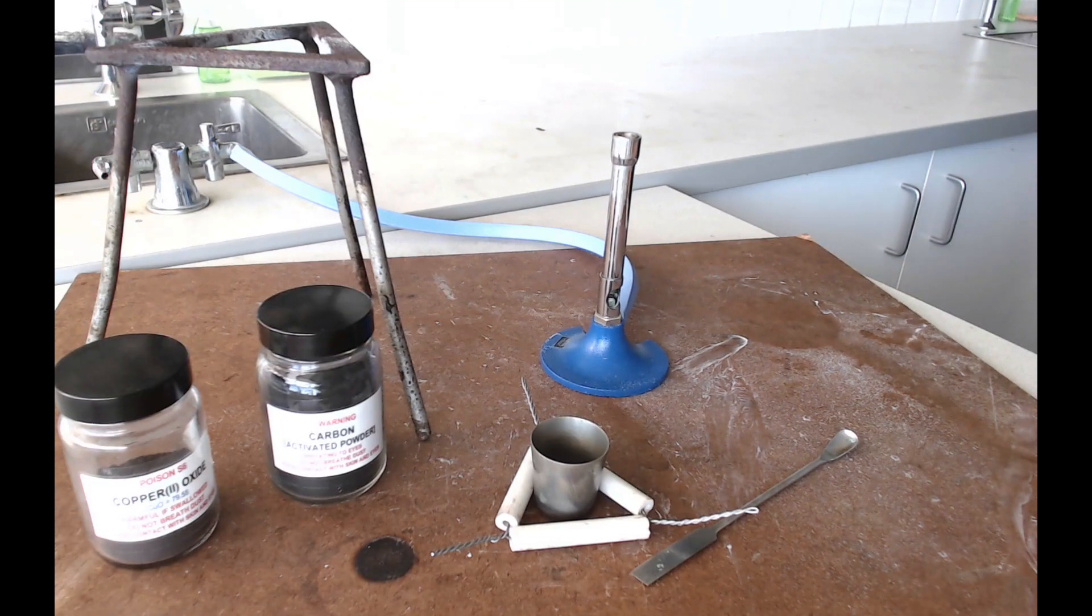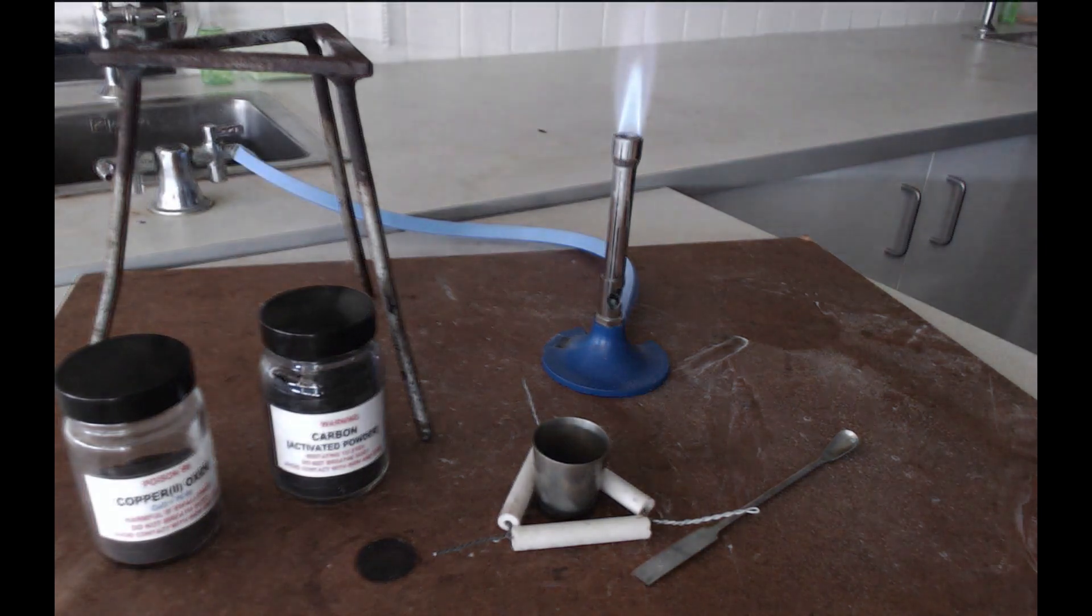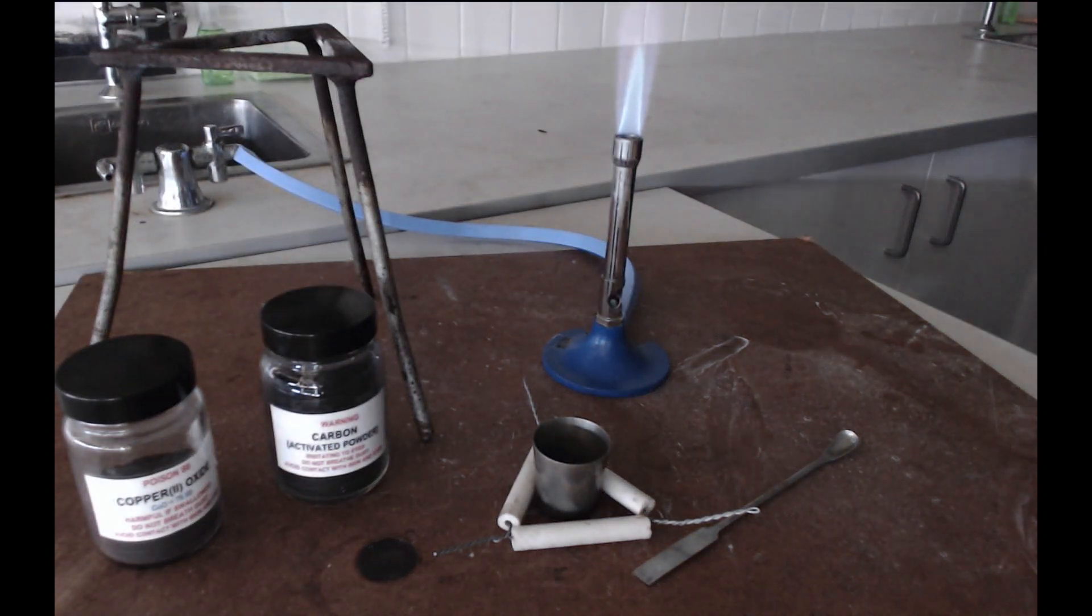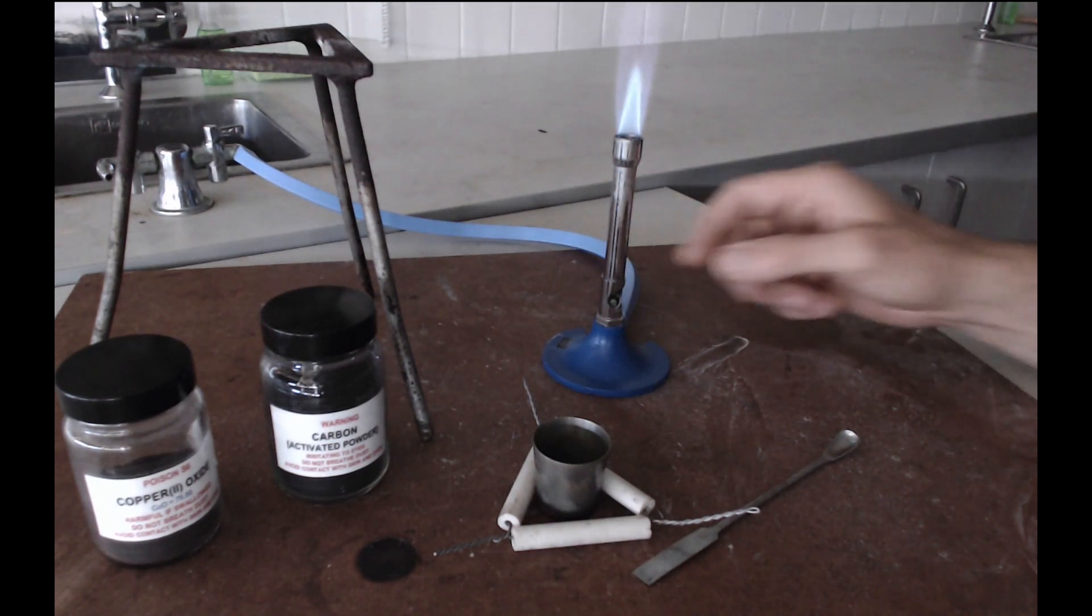I'm just going to dim the lights for a second so that you can see what this flame looks like and it's that tip of the blue flame that is the very hottest part of it so that's the bit that you want to heat with. So in other words you want to try and get that tip of the blue cone to be touching the bottom of your crucible.